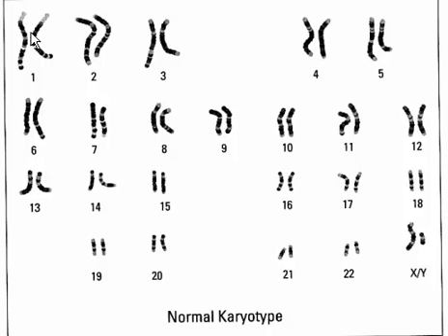The colors that you see on the chromosomes are produced by staining, and these staining patterns help to identify homologous chromosomes, because when the chromosome preparation is made, the chromosomes just don't pop out in this nice organized array. You get kind of a smear of chromosomes.